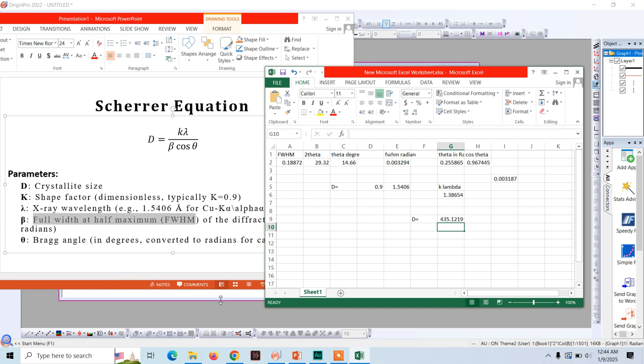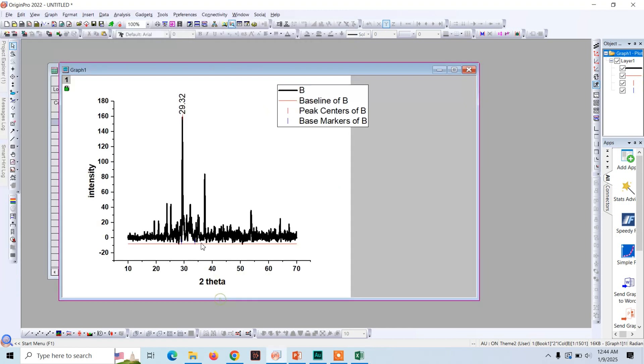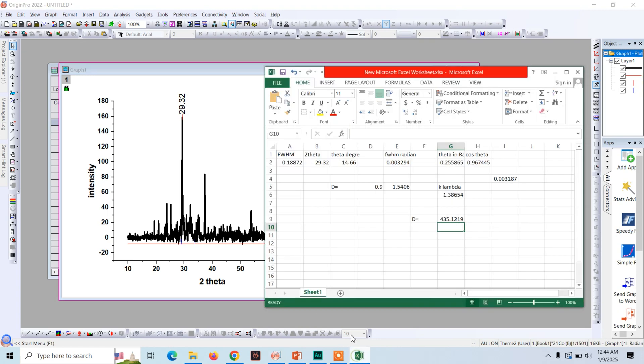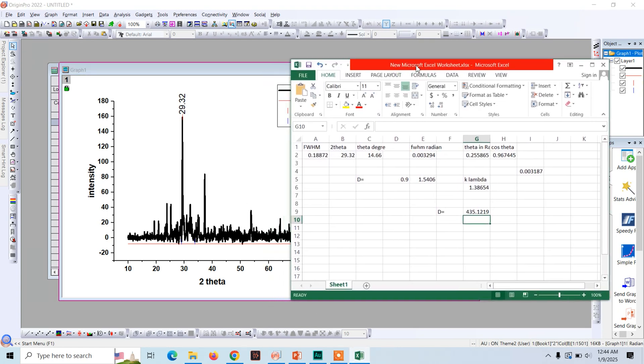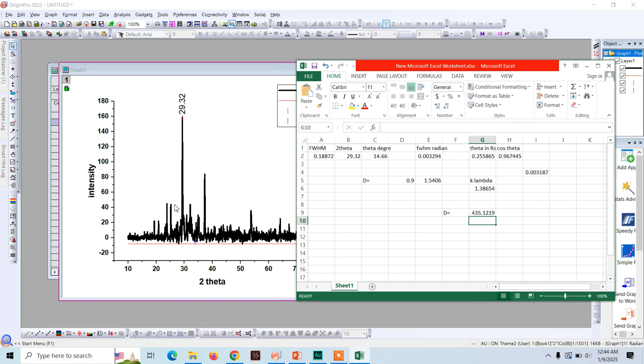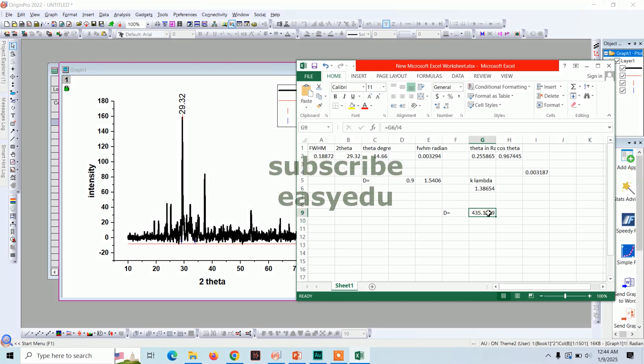Now remember one thing, we have calculated the crystallite size just for this single peak which appears at 29.32. For calculation you need to have multiple peaks and you need to do this calculation for each peaks, and then you can take the average size. So you will get a value for average crystallite size. And this value here, if you want the result in Angstrom, you can convert Angstrom to nanometer.